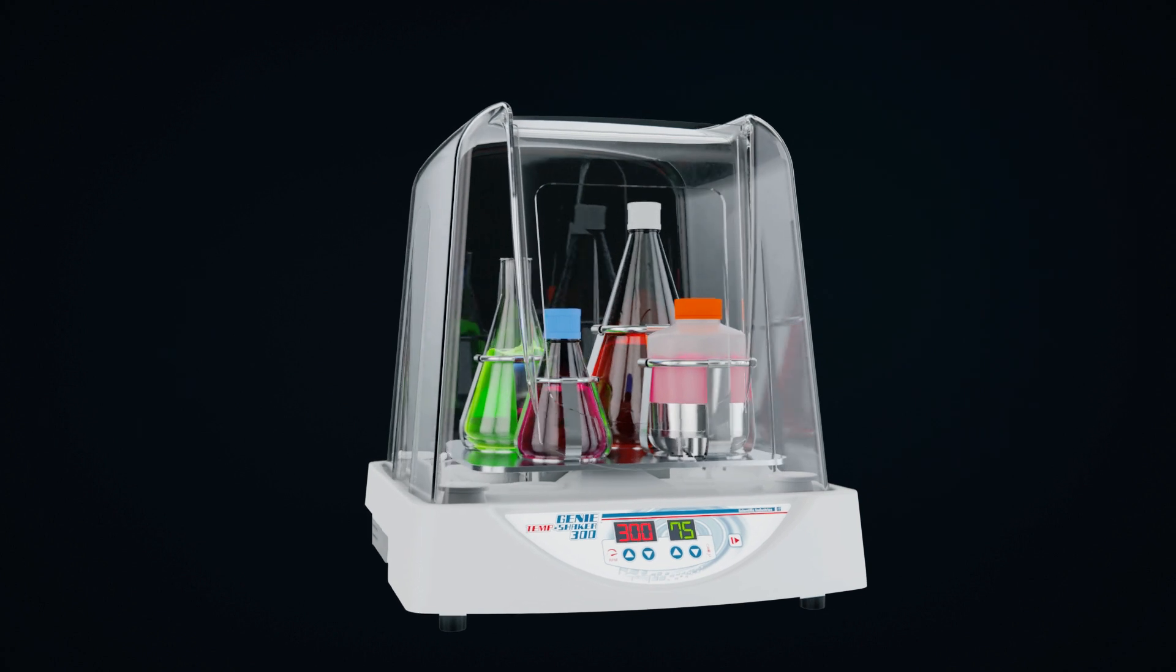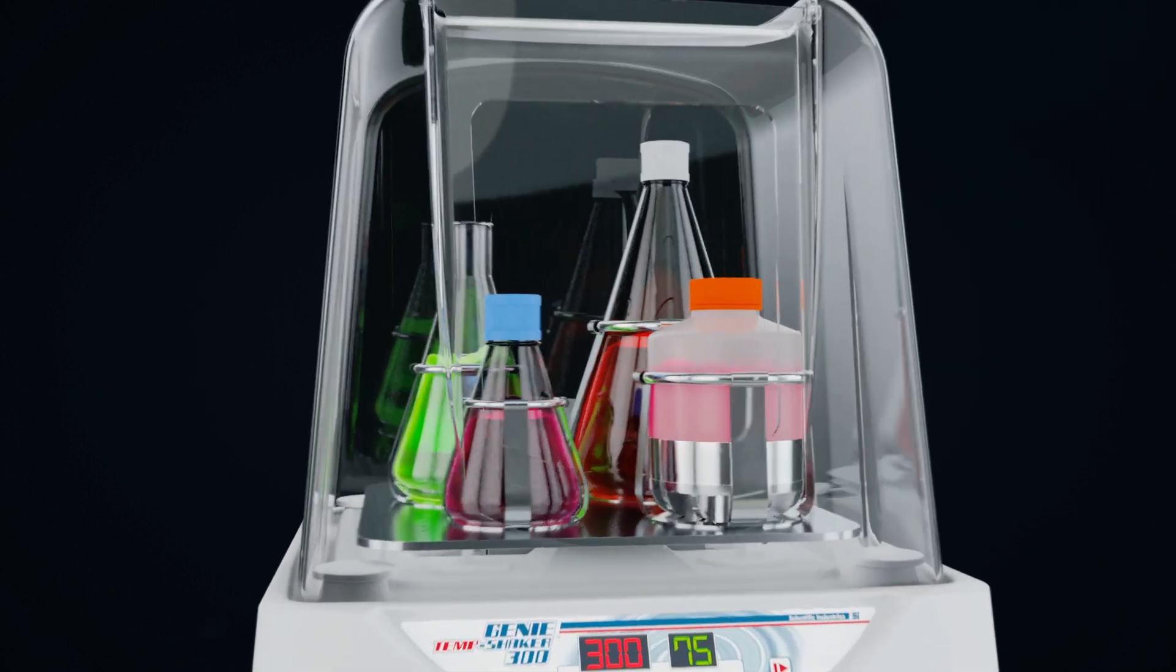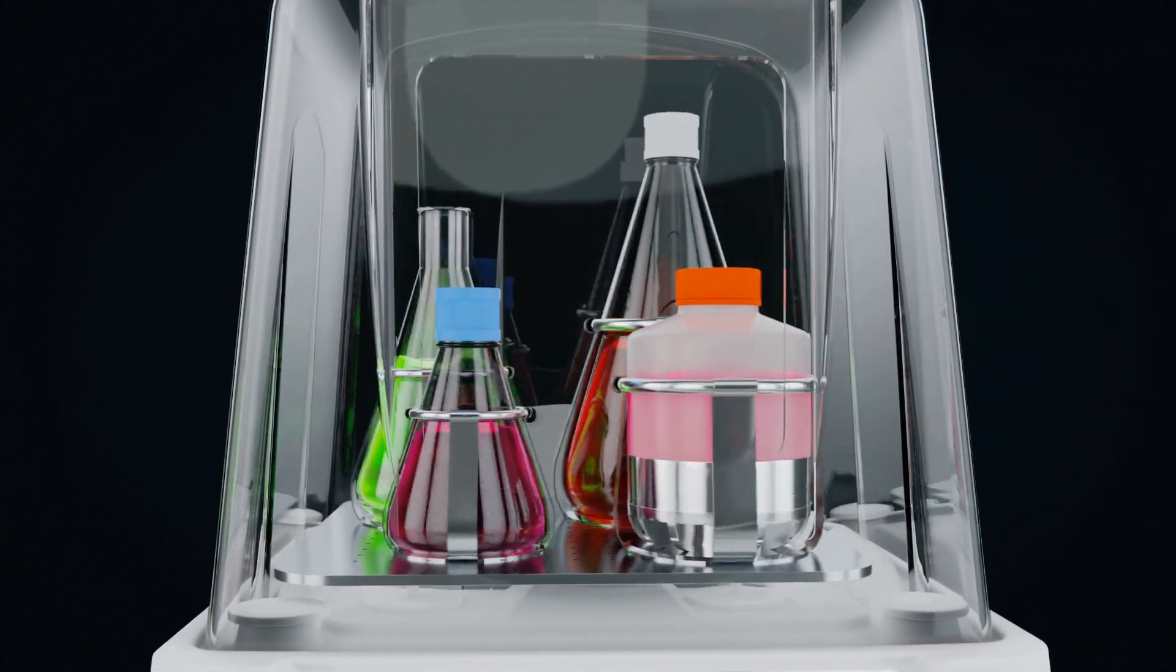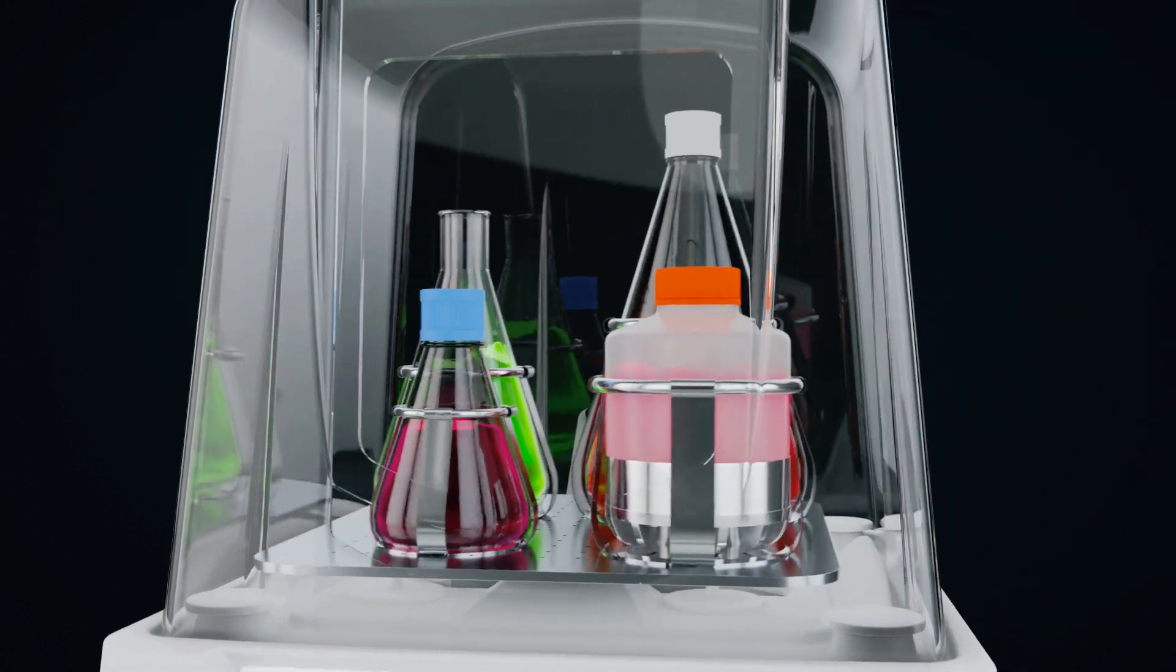The genie temp shakers are perfectly counterbalanced and equipped with a robust pulse width modulation motor for ultra high torque performance.